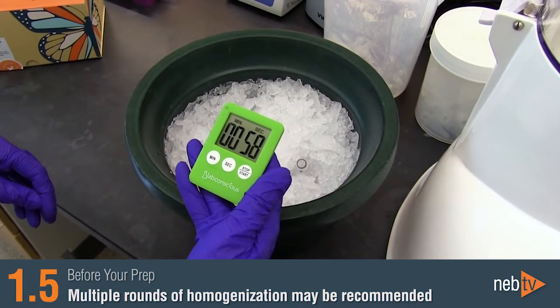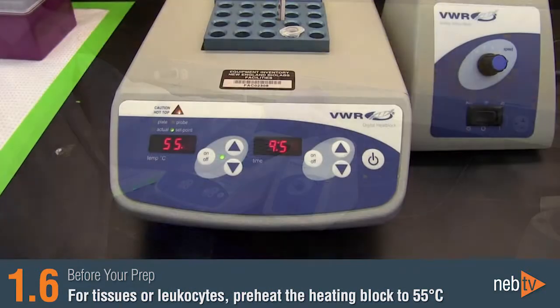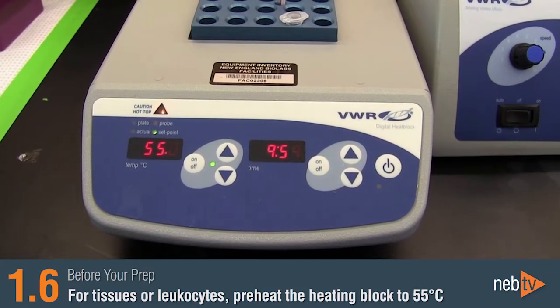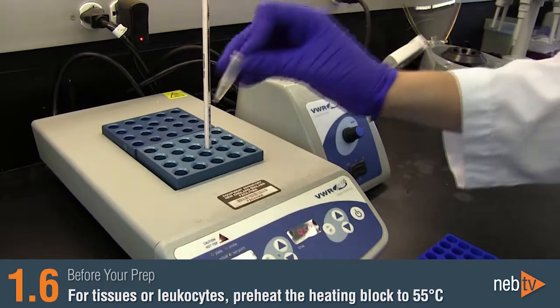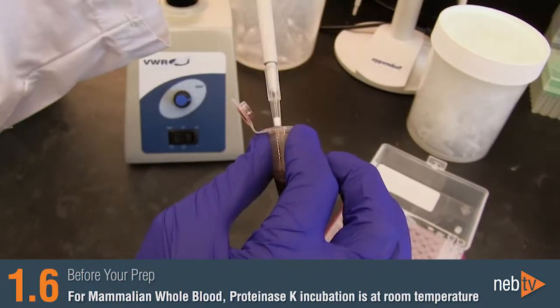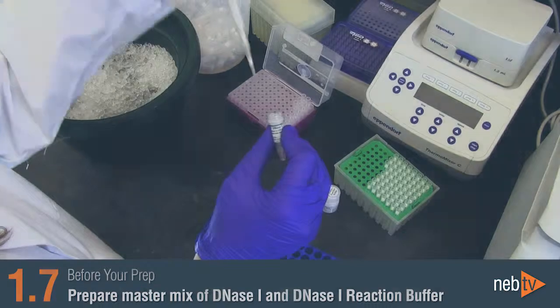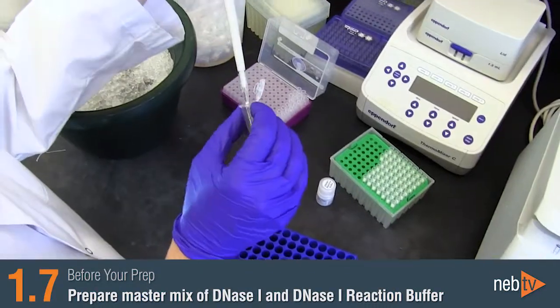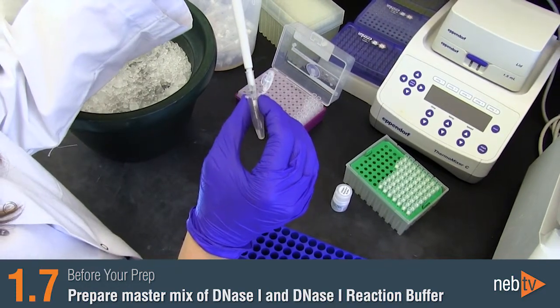If you are working with tissues or leukocytes, it can help to preheat your heating block to 55 degrees Celsius before starting your prep, so that the heat block will be at the correct temperature when you get to the proteinase K incubation. Please be aware that when working with mammalian whole blood, the proteinase K incubation is carried out at room temperature. We also recommend preparing a master mix of DNase I and DNase I reaction buffer prior to beginning if you are performing multiple preps at once.